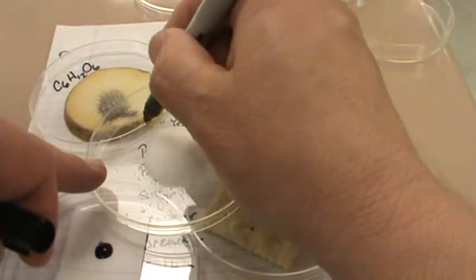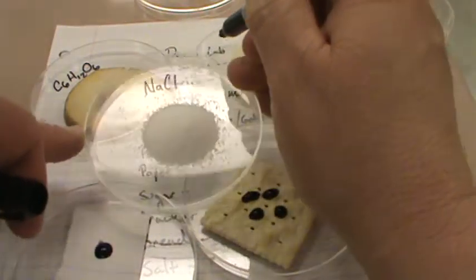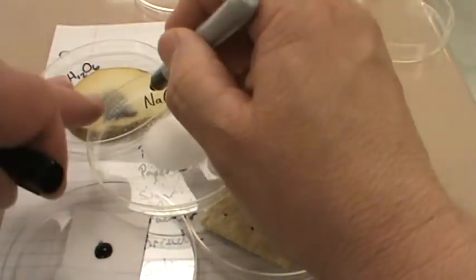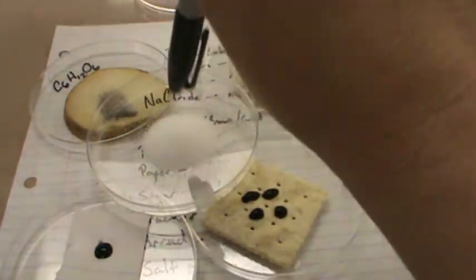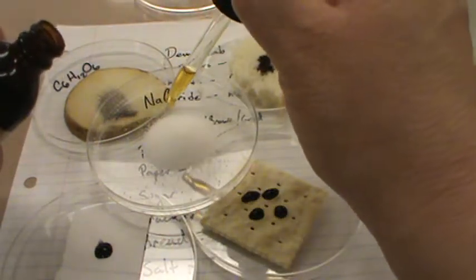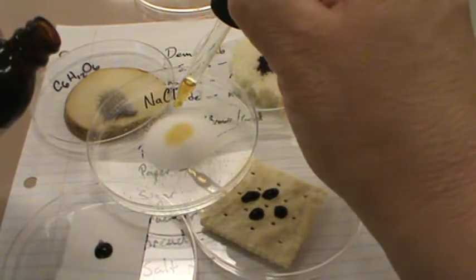But in salt, this is NaCl. NaCl is its own different molecule, sodium and chloride. This is carbon, hydrogen, and oxygen. So salt, of course, is not sugar. But I'm going to use this as a control. I want to know, will this react with the iodine? This is a food. It looks white, but no.